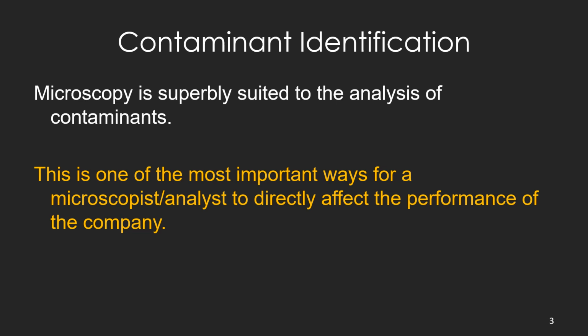The first point is microscopy really is ideally suited to contaminant analysis, and in some cases, it's the only tool. If you have a biological specimen, if you have pollen or something of that sort, the only way that you can truly identify that is with microscopy. And I think this is one of the ways that the microscopist can have a real direct impact and effect on the success of the larger organization.